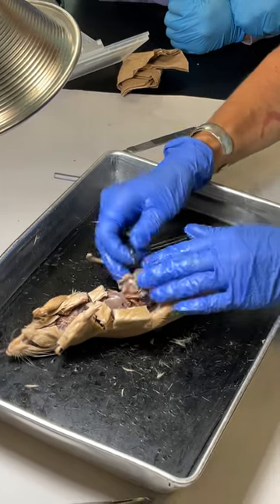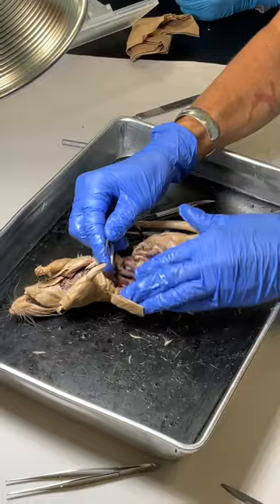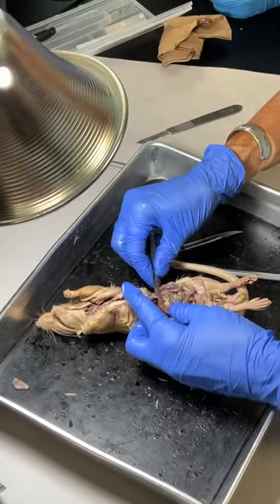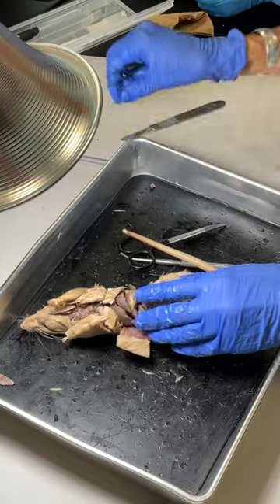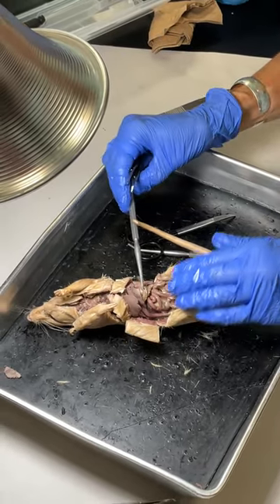Ileum. Ileum. What's this stuff? Jejunum. That's coming off of the stomach. Duodenum. Duodenum. Close enough. If the probe is this way, what's the sphincter?